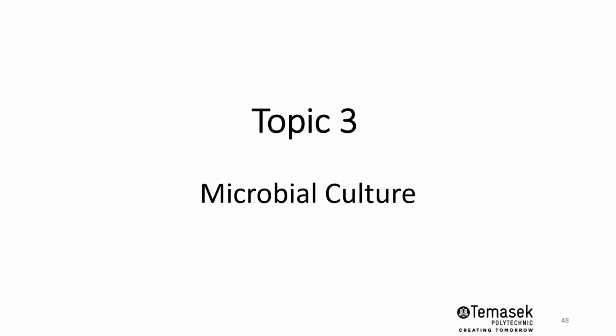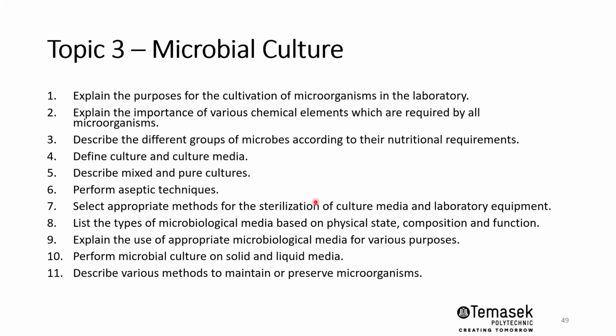In this last part of topic 3, we'll be focusing on microbiological media based on their function. In the earlier part, we talked about the physical state as well as its composition and the different types of microbiological media. We will also be explaining the use of it as well as the different methods that we can use to maintain or preserve microorganisms.